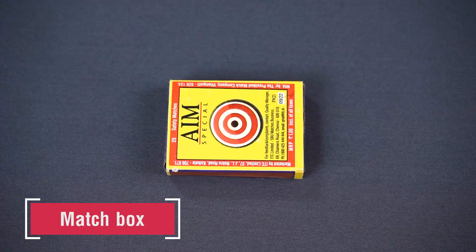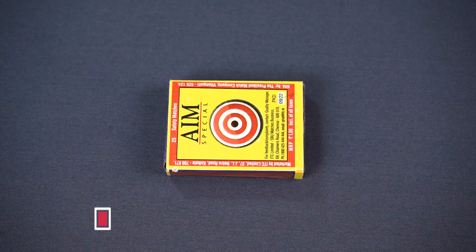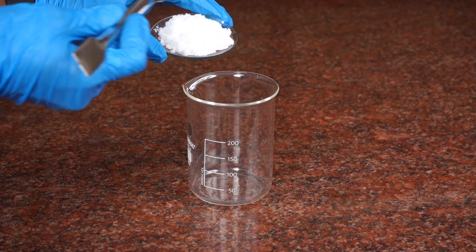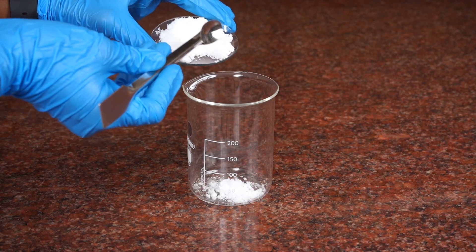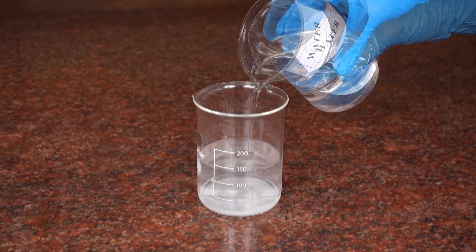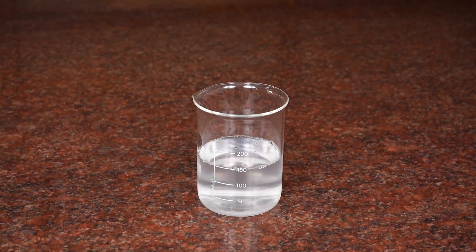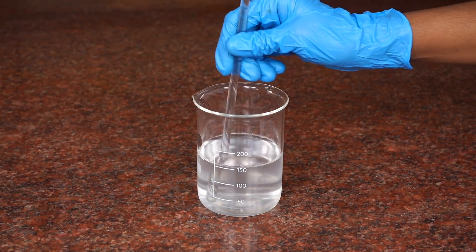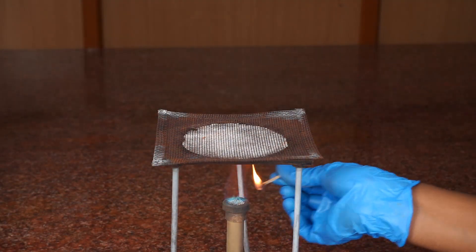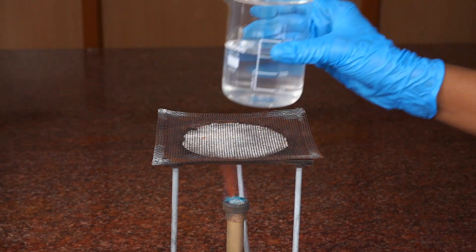Procedure: Take a small amount of common salt in a beaker. Add minimum amount of water to it. Stir the solution using a glass rod to dissolve. After dissolving the salt, keep the beaker on the tripod stand.